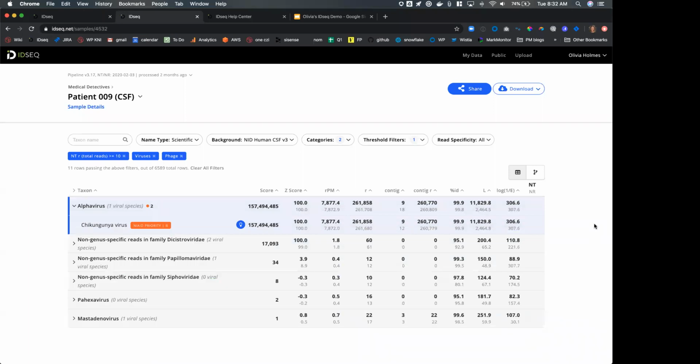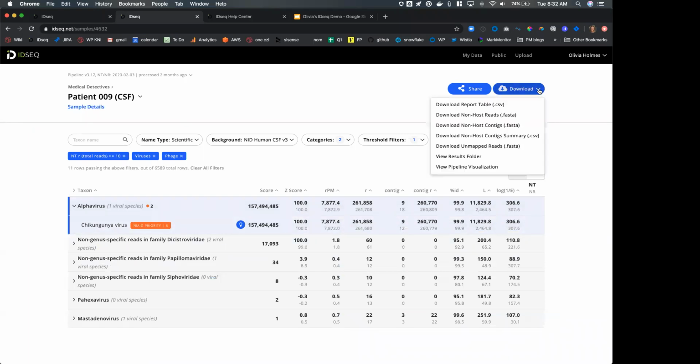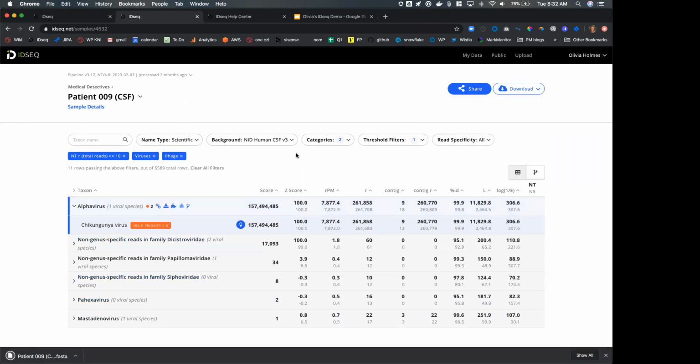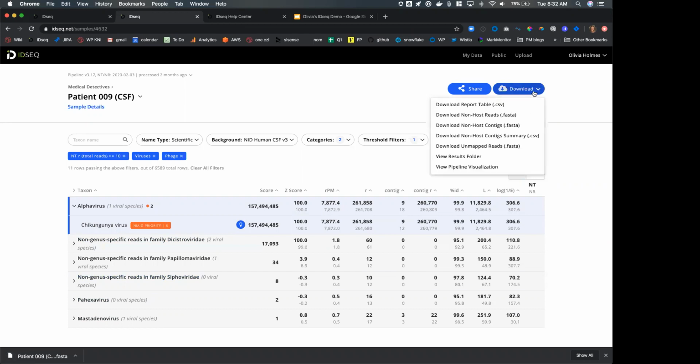We do offer a couple other ways of downloading this material and the data that's presented in the report. So if I go to this upper right-hand corner, I'm presented with a couple different download options. So right now, I believe if I chose this, let's see, this just kicks off the download right away.